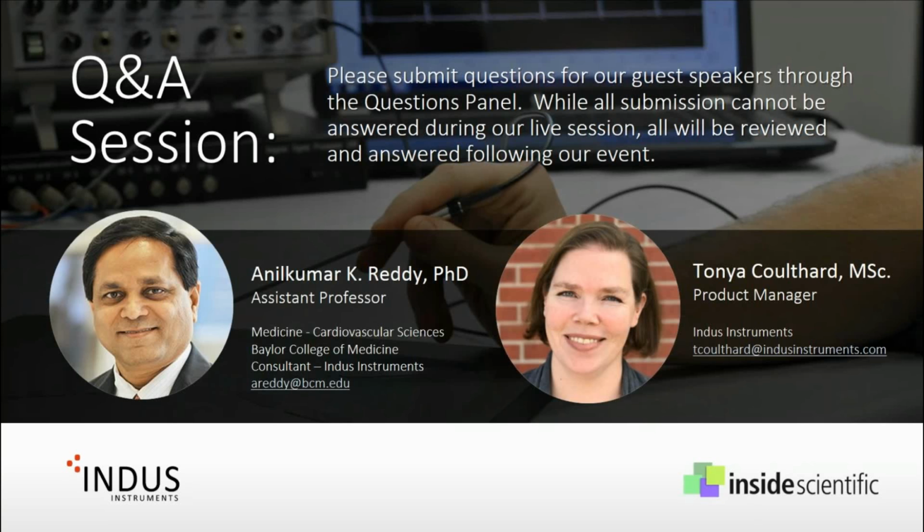Let's just ask maybe a couple more questions. Anita has asked, she mentions that they use very large mice, greater than 50 grams, in their cardiac echo experiments, and she'd like to know how the Doppler probes would perform with these fatty mice. Sure. So why don't I take that one?